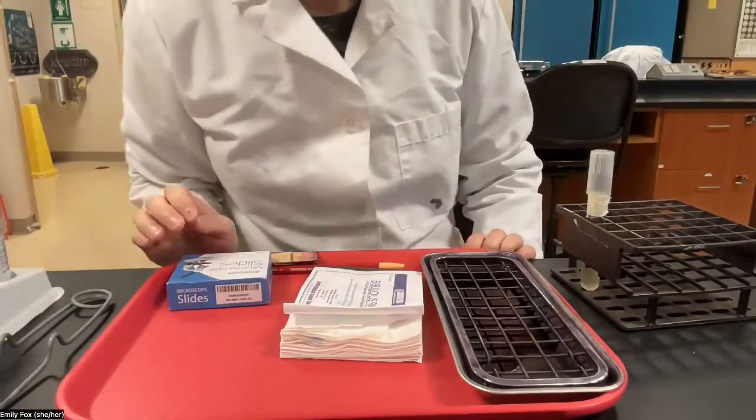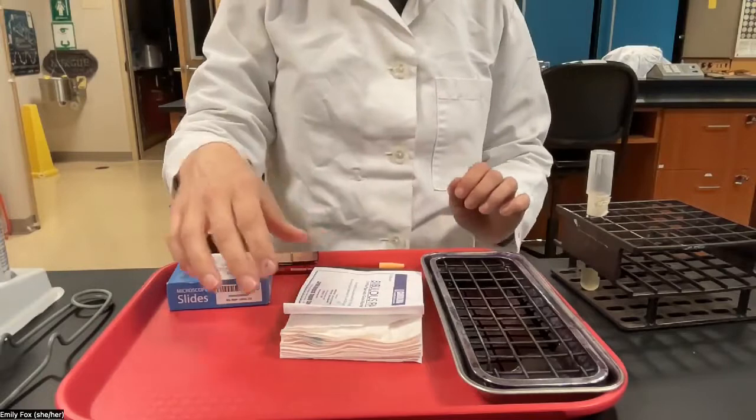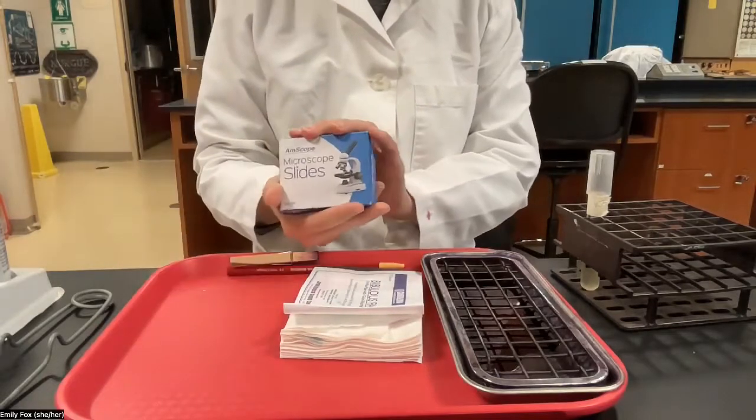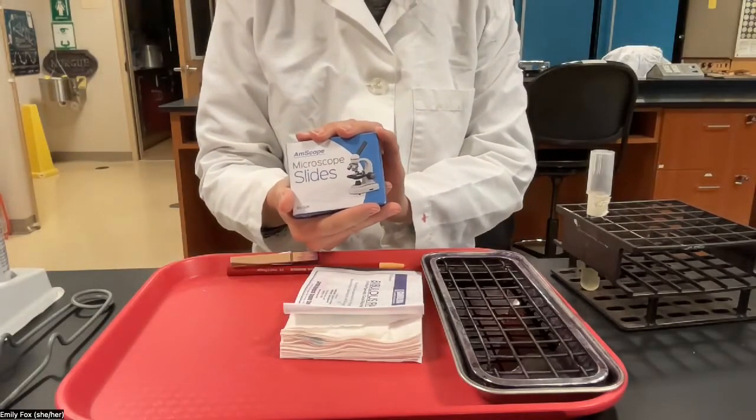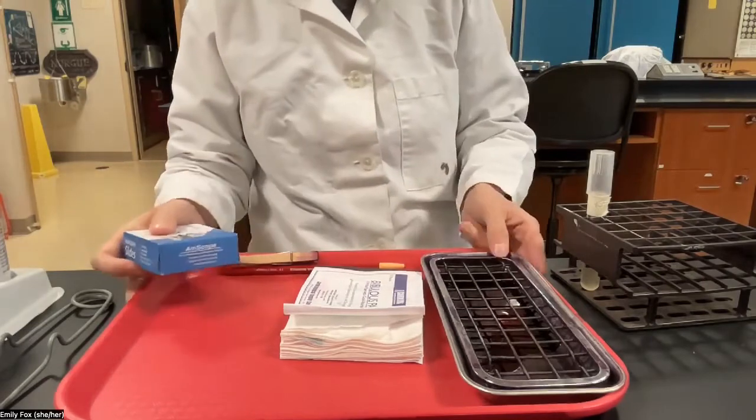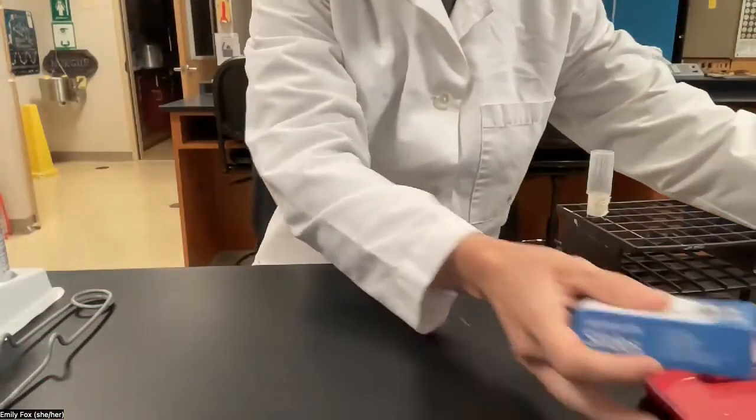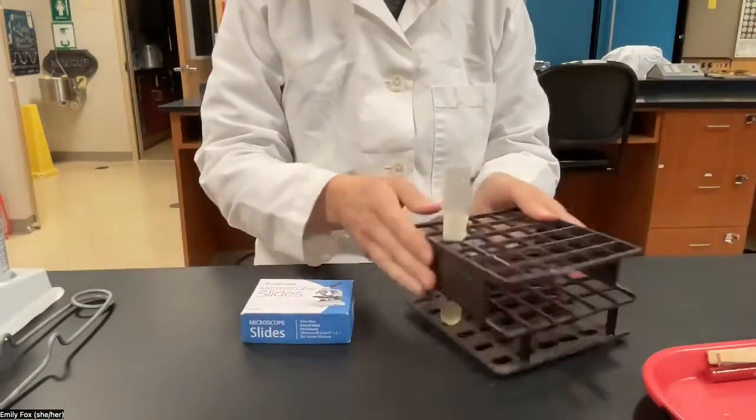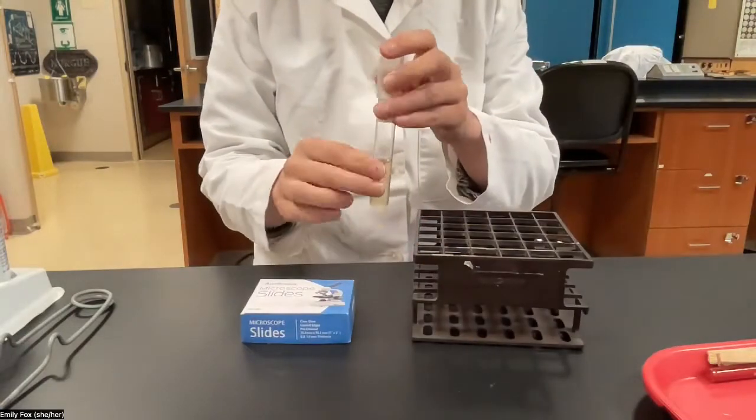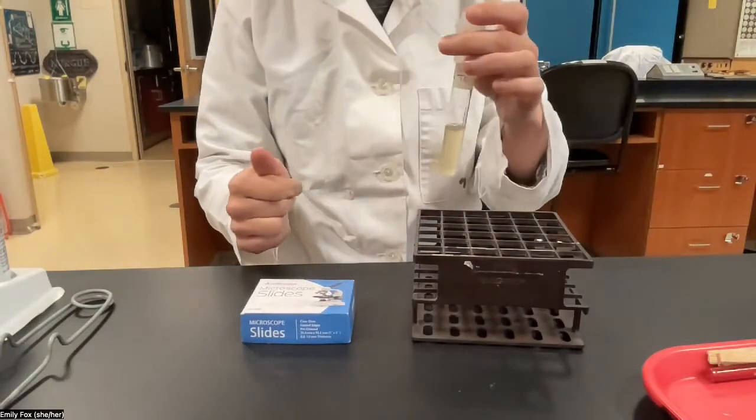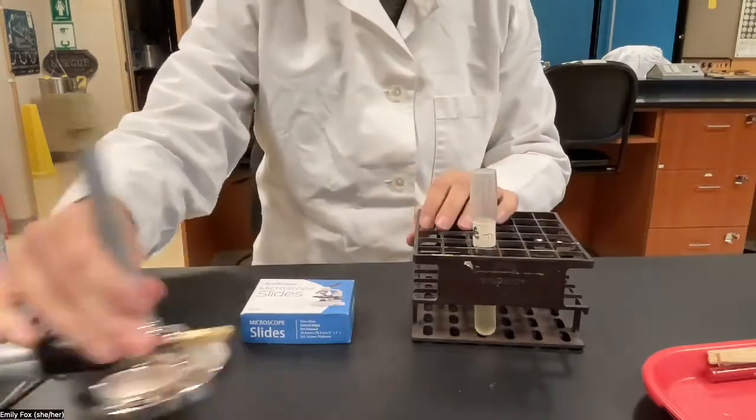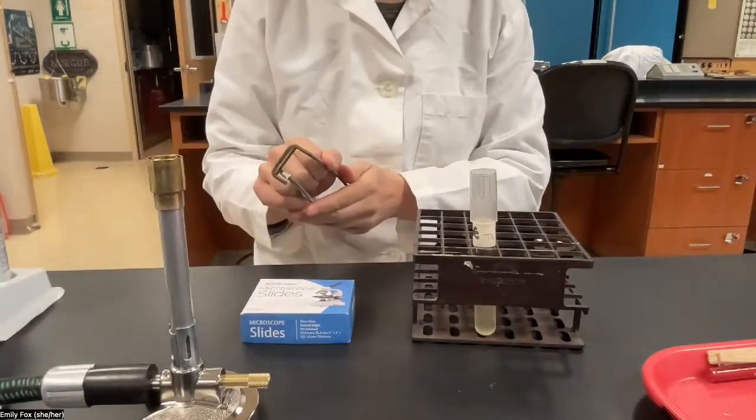These are the materials that you'll need for the Gram stain. The lead slides to put your bacteria on. Let's start with that part. Slides, a tube of broth culture with bacteria, a Bunsen burner, and a striker.